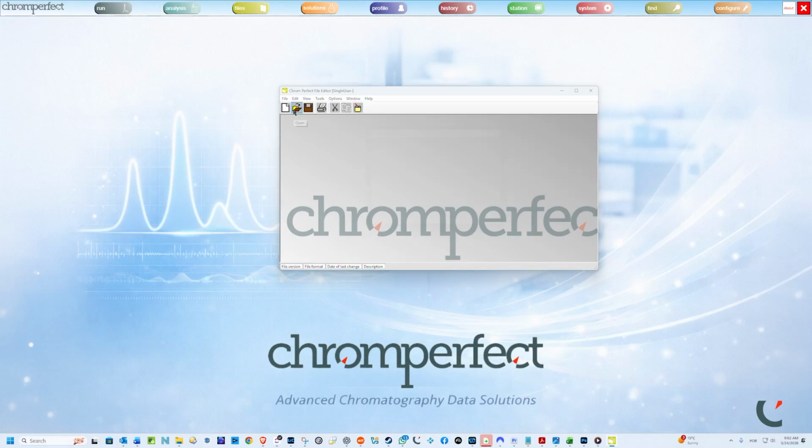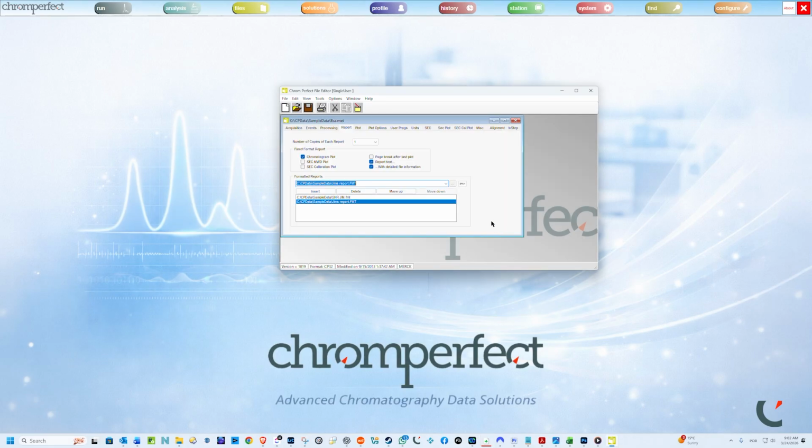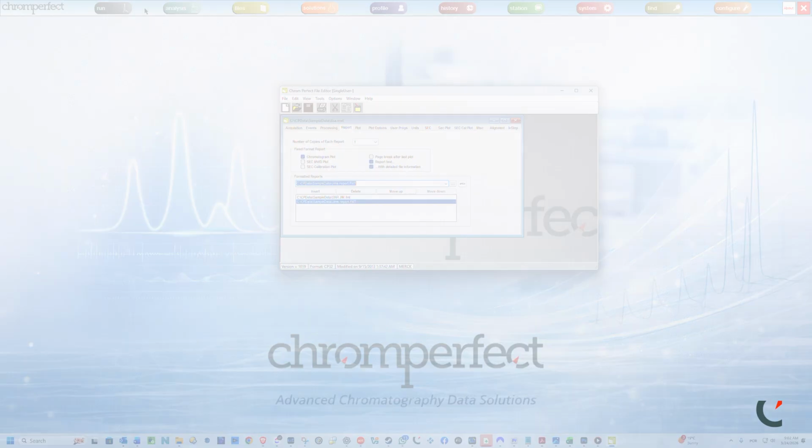Format files can be stored within a method file. This means that when a method is used to process data, the reporting structure is already defined, travels with that method, and can be applied automatically during processing at the end of a run or during post-analysis using batch reprocessing. This ensures consistency, as the same method will always produce the same style of report unless it is intentionally modified.